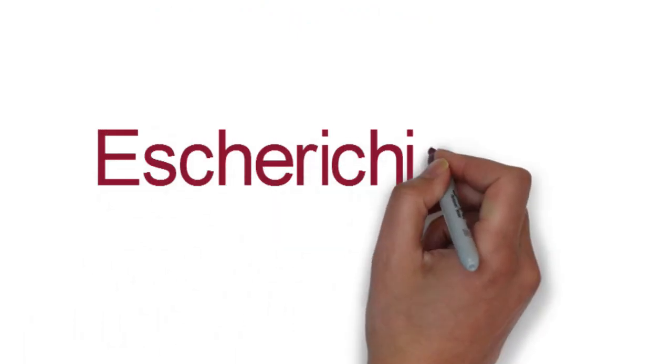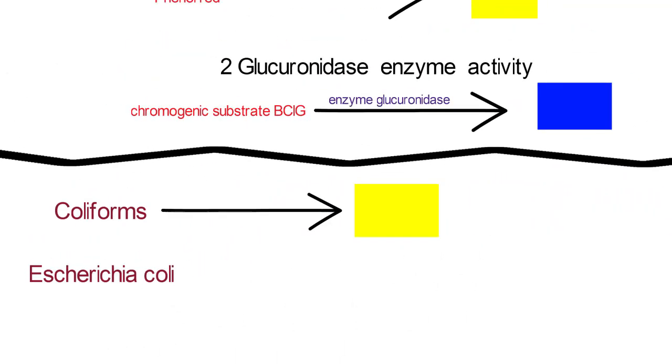Escherichia coli is both lactose positive and possesses glucuronidase, so will appear as green colonies.